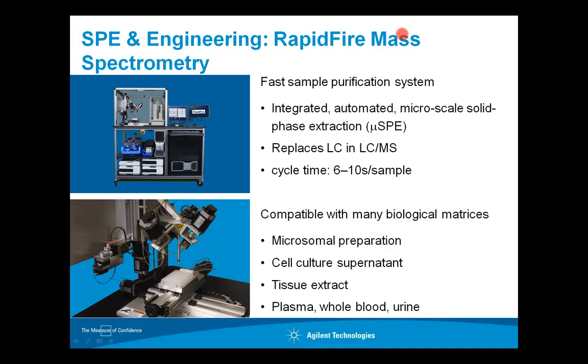Thus, RapidFire is replacing the liquid chromatography portion of the LC-MS system. So it's without a full gradient, which chromatography has, but this results in samples being processed by the RapidFire system in as little as 6 to 10 seconds each, which is nearly 10 times faster than traditional HPLC.